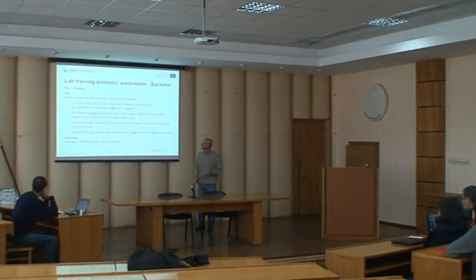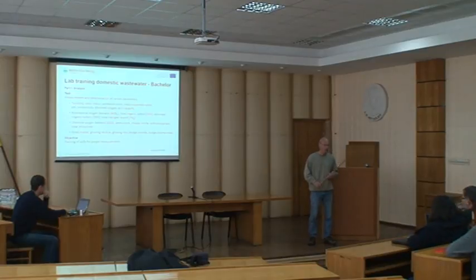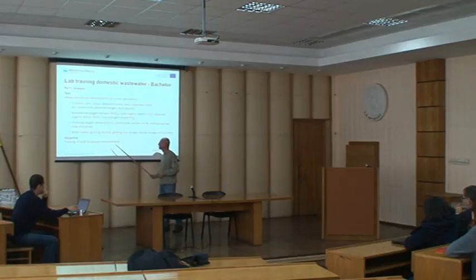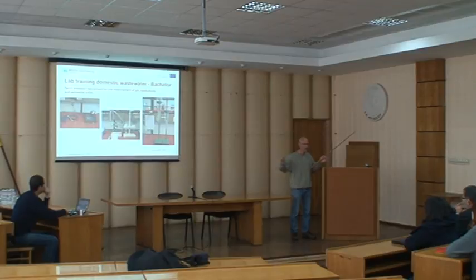organic carbon, dissolved organic carbon, of course, and parameters like chemical oxygen demand, which is a sum parameter, which is very important, for example, for industrial wastewater, and dried matter, glowing residue, and so on. So the objective here is training of skills for the proper measurements. How do I measure properly? So everybody can measure, but the results may vary in a broad spectrum.